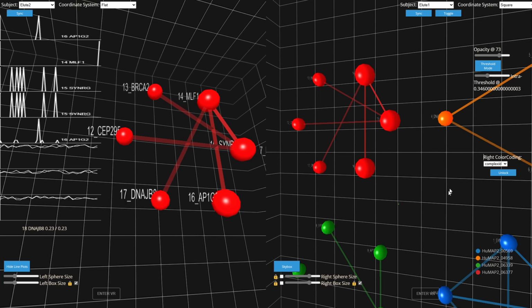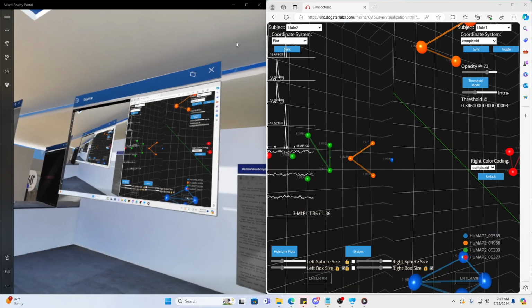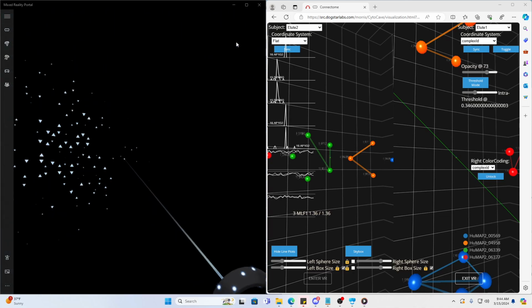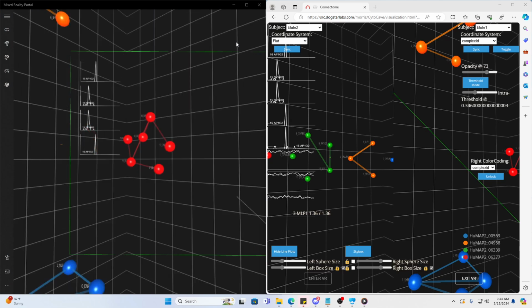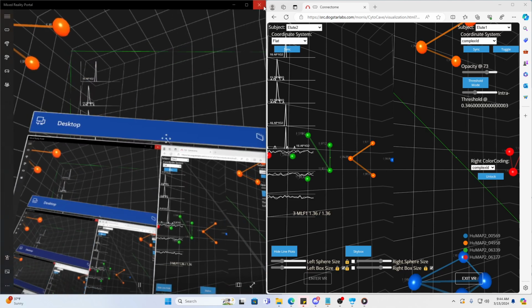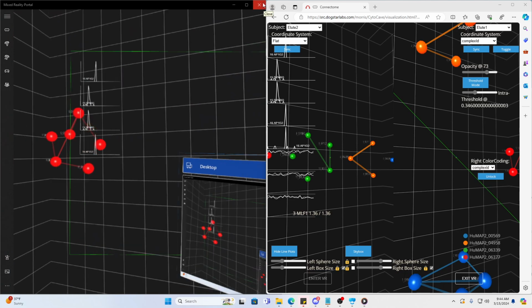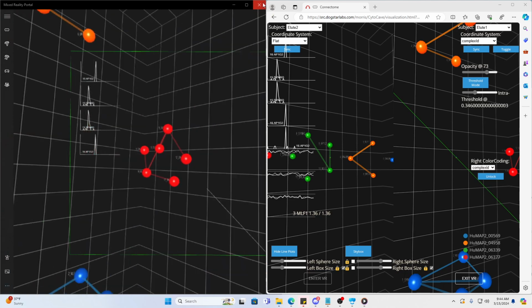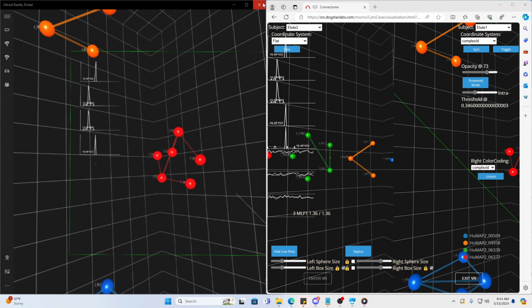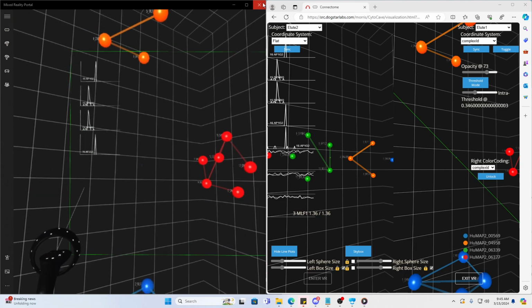And finally, I'll demonstrate how VR can be used to browse this dataset immersively. Click the Enter VR button. It shows you the same view from the same angle as you were browsing in the 2D view on the web browser.